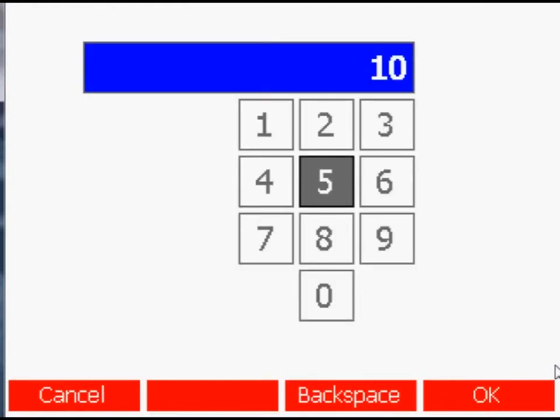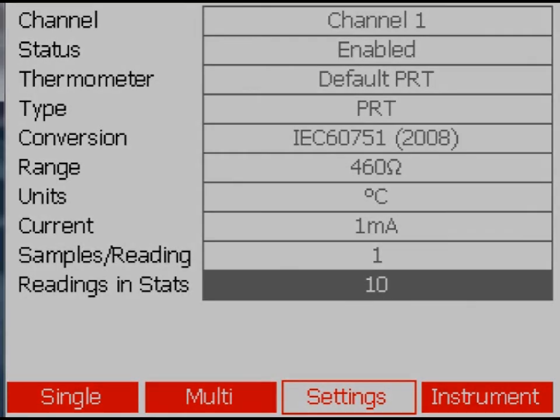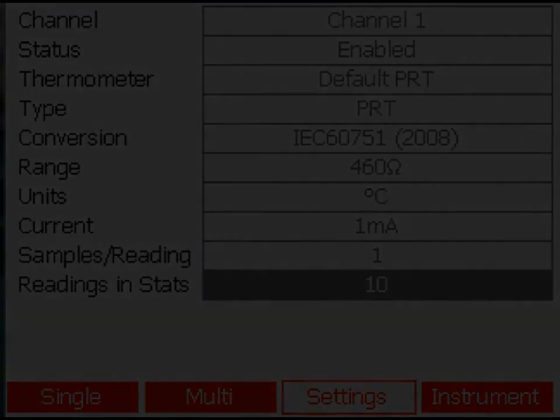The sample/reading is initially set to 1 but can be increased to a maximum of 100. This will cause the MillerK to take the specified number of samples for each reading and will reduce the noise at the expense of measurement speed.